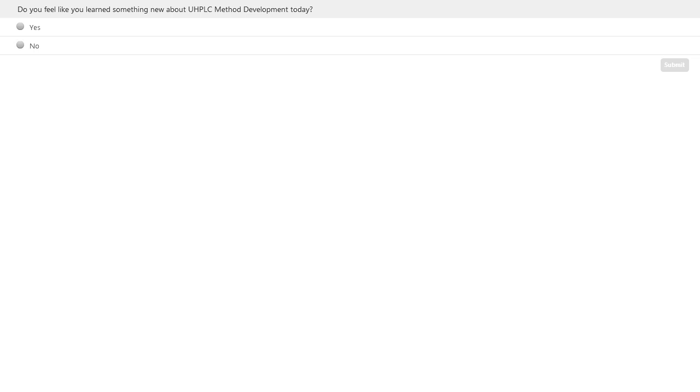We actually have a nice ACE application knowledge note on how to do that. And there is a tab within the translation tool that walks you through the methods. You basically run a gradient with acetone, and it shows you, then you work out the midpoint, and it gives you a value for your dwell volume. So I'd again encourage you to have a look on the resources section for that knowledge note.